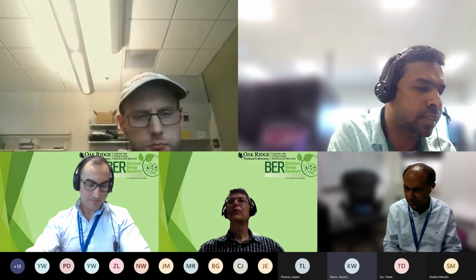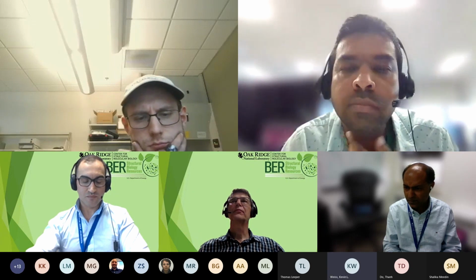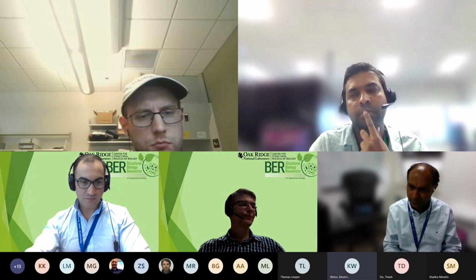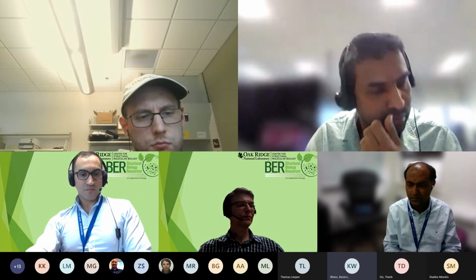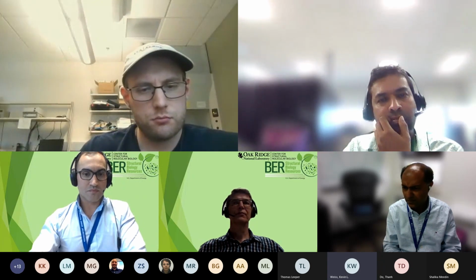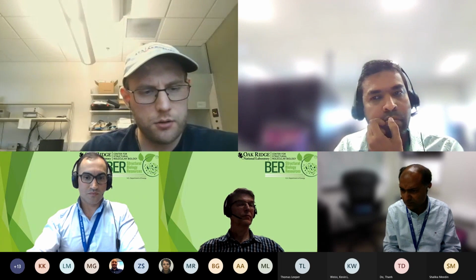I don't really have much to add. It's kind of system dependent, and you can tweak things with buffers a lot of times to help minimize aggregation. The same thing could be true with a His tag. So it all depends on the system, the pH and the solution that you're using, and how concentrated it is as well. Okay. Thanks.